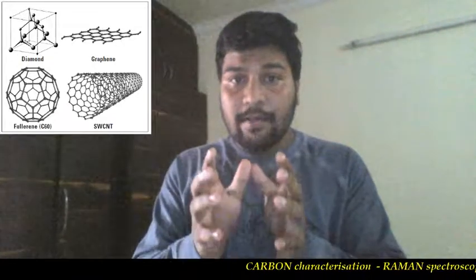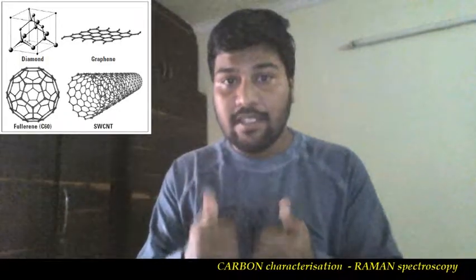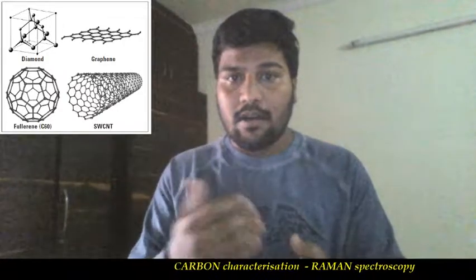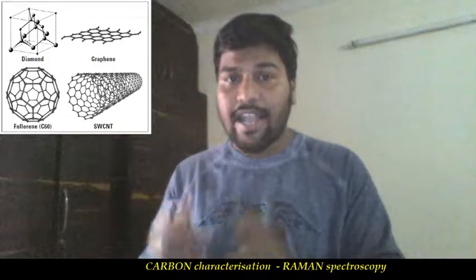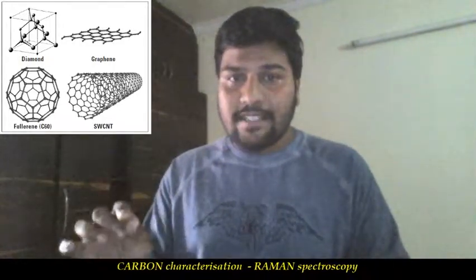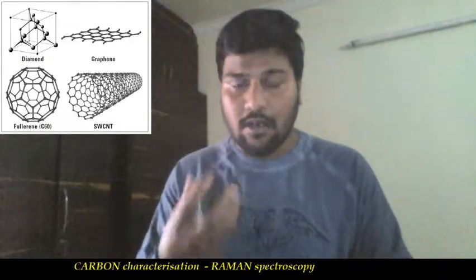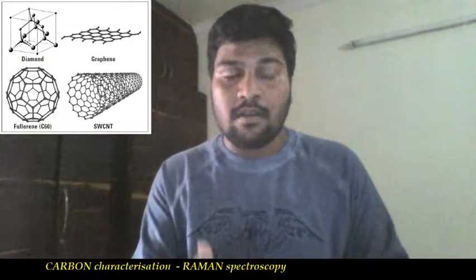It identifies the vibrational frequency or the vibrational mode in which the atoms or the molecules in the given material oscillate. By identifying this vibrational frequency, every material has its own signature or fingerprint region of vibrational modes. Based on this, we can figure out the material.